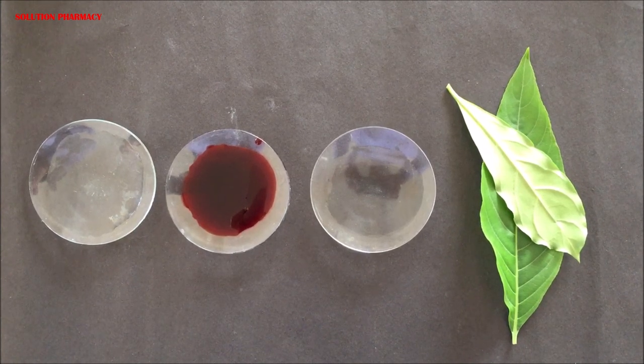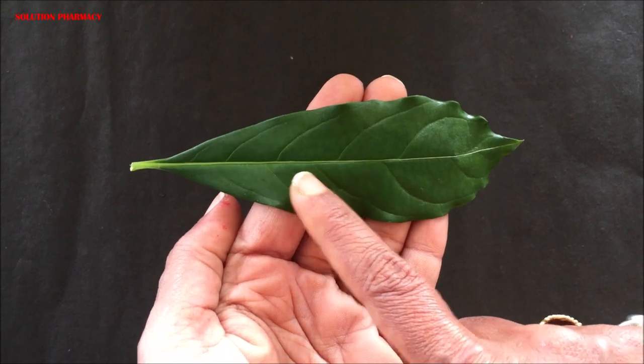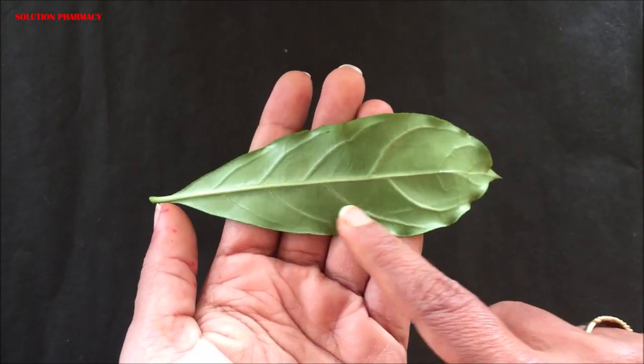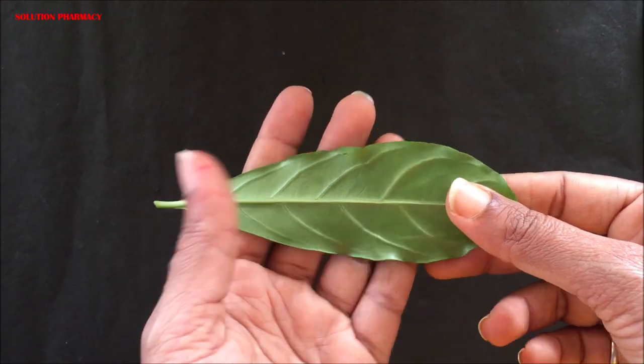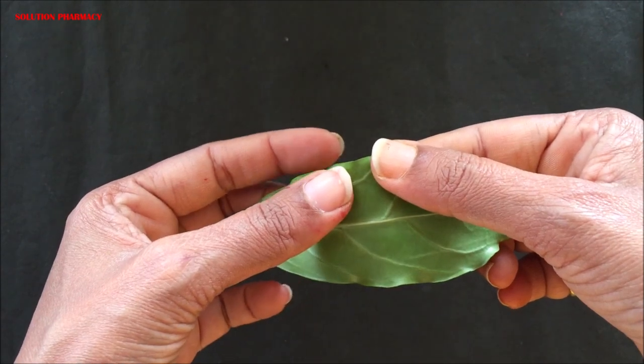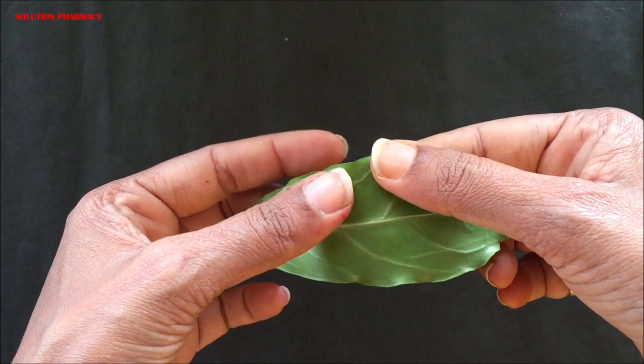This is the upper surface of the leaf, which contains the upper epidermis — the upper epidermal layer. This is the lower surface, which contains the lower epidermal layer. The epidermal layer is the outermost transparent layer present on the surface of the leaf.